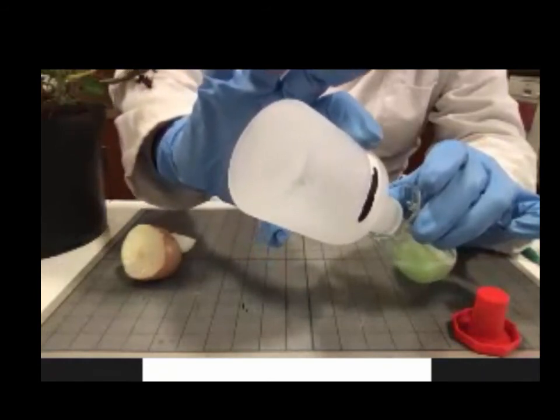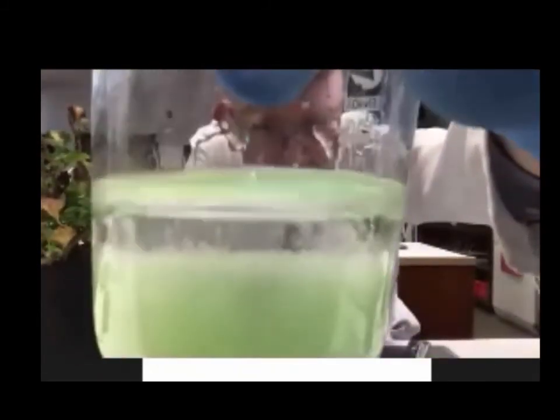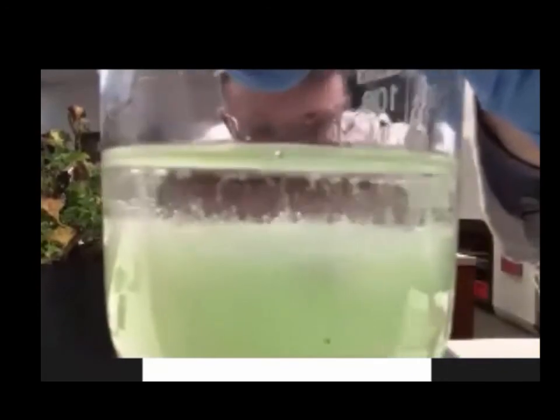Now, freezing alcohol doesn't mix so easily with water. And then what we should see, let's just make that horizontal, is strands of material rising up from the aqueous stuff at the bottom. And that is supposed to have DNA in it. Okay. That is, believe it or not, the positive result.